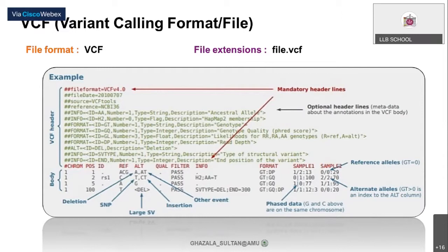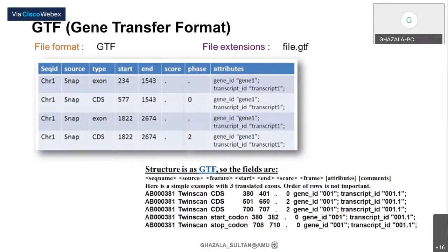Yes, depending on the data type and what kind of study you are actually into, that will determine what type of file format you will be dealing with. These different files we can get from different databases. I will also show you in the practical session where we can get these files.